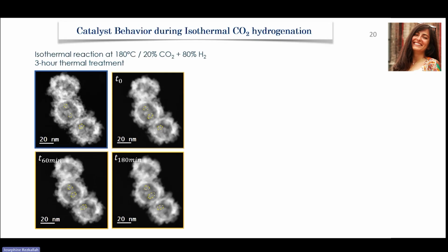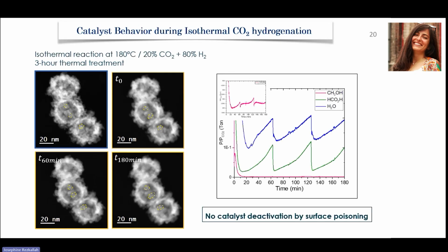During these 3 hours, the reaction products are analyzed also simultaneously, and the reaction response in terms of their partial pressure is stable. So, taking, of course, into consideration the origin of this fluctuation, this stable response is also an indication that there is no catalyst deactivation by surface poisoning. Finalizing with this experiment, the study is conducted over this material.